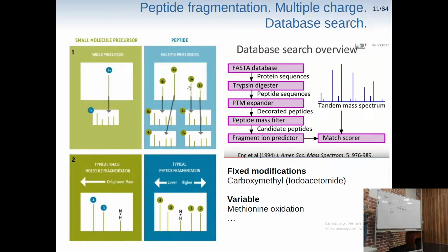Because we'll get more charge on our fragments, and one thing that is not obvious, which I have to mention here, can be misleading. For instance, let's say that we have some ion here which we want to fragment, and after fragmentation, we get the following picture. We get some fragments which look heavier than our precursor. Why do we have those fragments which look heavier?